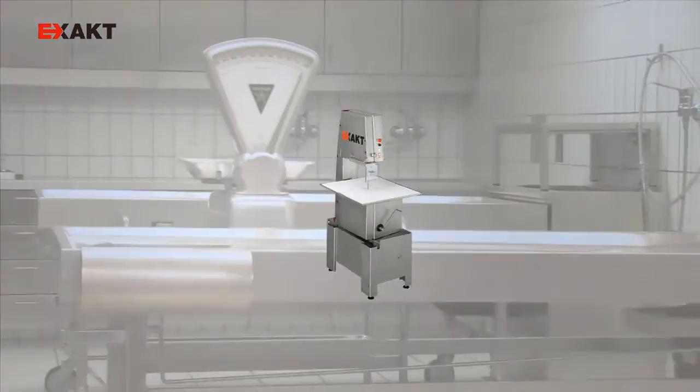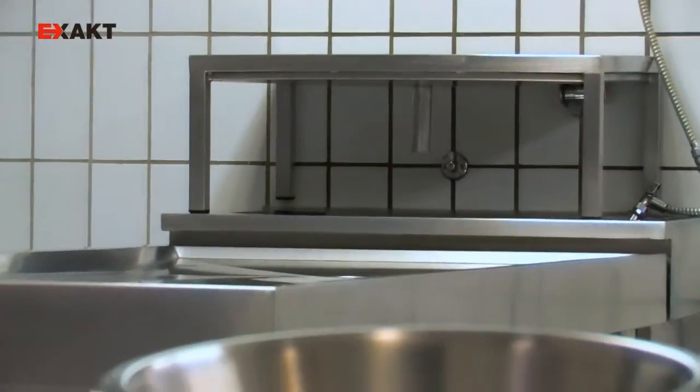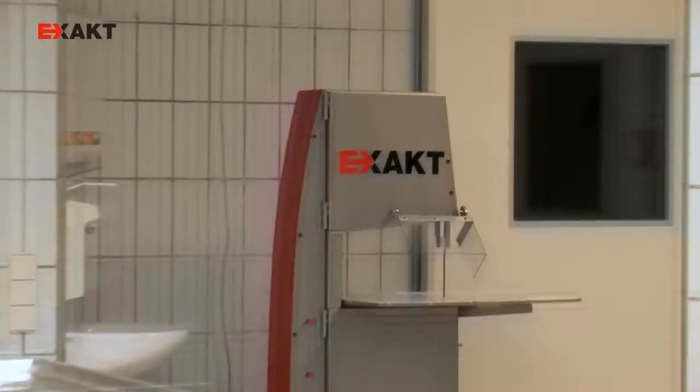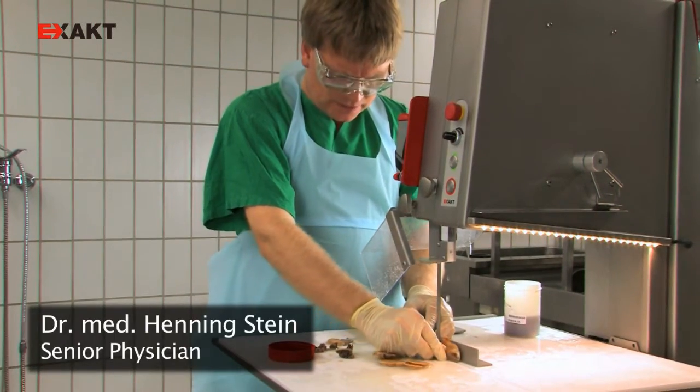The exact pathology saw has been especially designed for the working conditions and requirements of pathologists. It facilitates the precise, safe, and hygienic preparation of bone and fresh tissue samples. It is possible to work with the saw very safely.